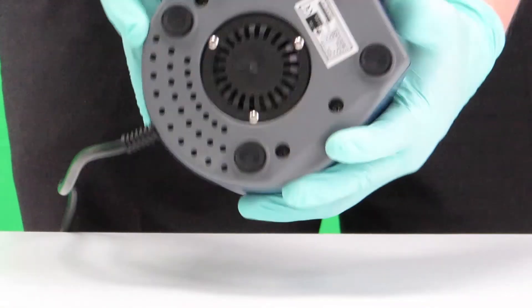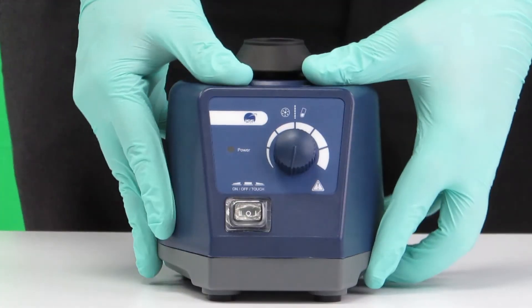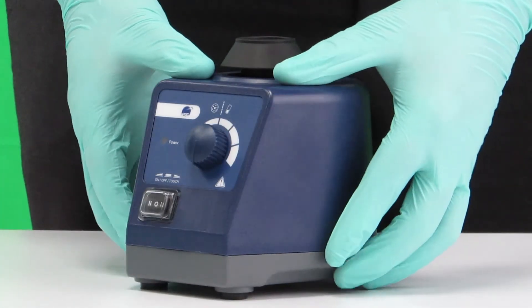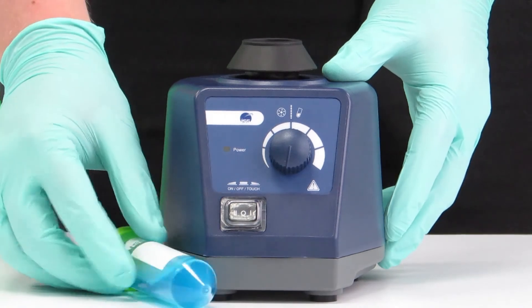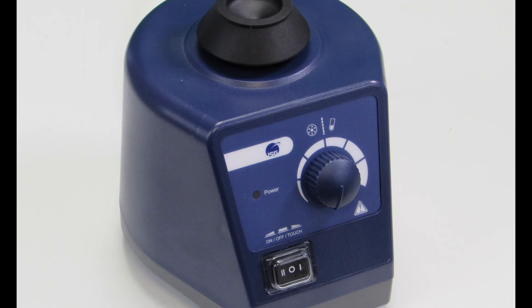This vortex mixer also features anti-vibration feet which ensures stable operation during processing. This portable high quality unit is a great addition to any laboratory and is part of the ISG equipment family. For more information you can look on our website.